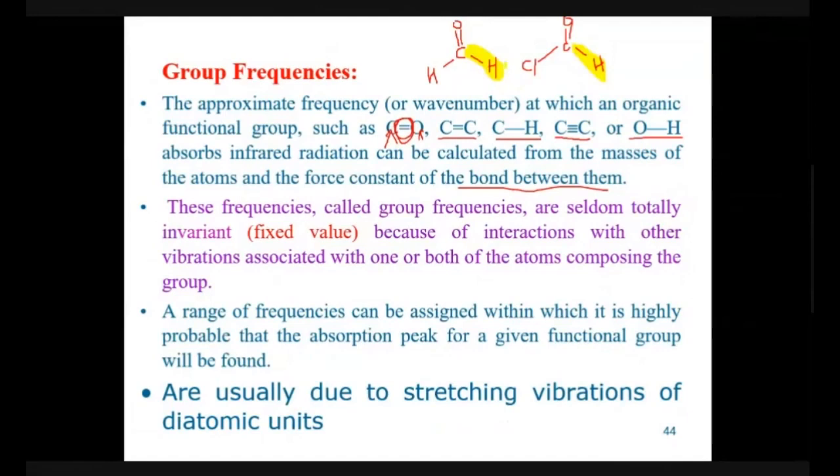Although it will not be exactly the same, it will be near. The value of frequency will be near each other, although not fixed. A range of frequency can be assigned within which it is highly possible that the absorption peak for a given functional group will be found. So instead of giving one number, a range of frequency numbers is given to a functional group.